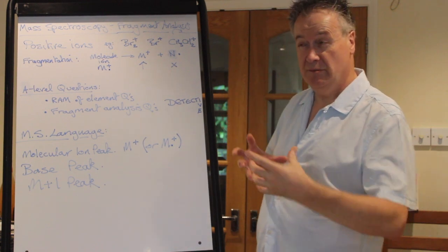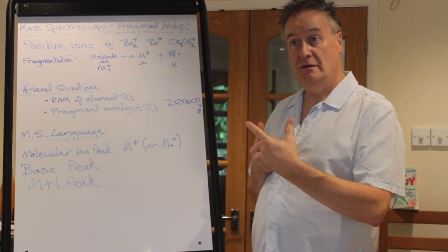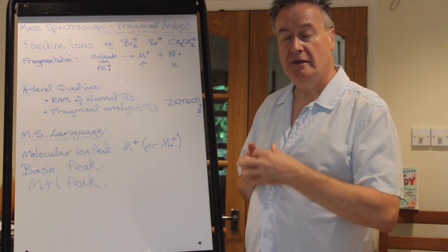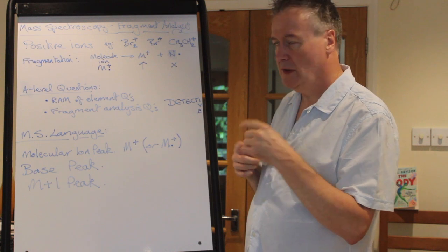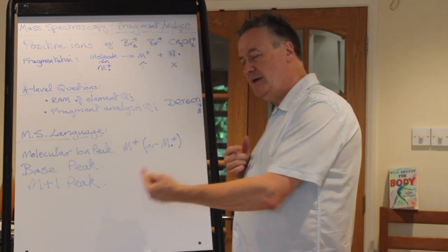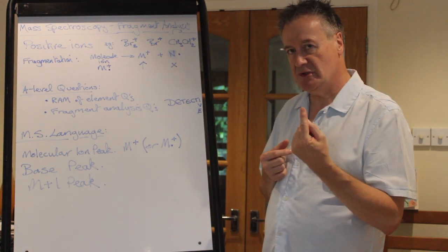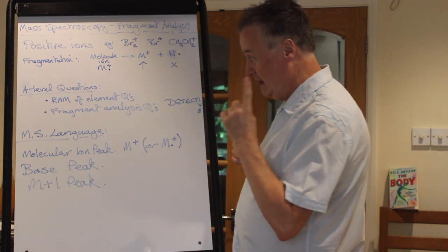And that's really important because in the mass spectrum that comes out, that obvious, heaviest peak, they're called mass to charge ratios. Mass divided by the charge will be 1 in all A-level questions. So that is the one furthest to the right that is of decent size, but it's not the absolute furthest to the right. So we'll come to that very soon.